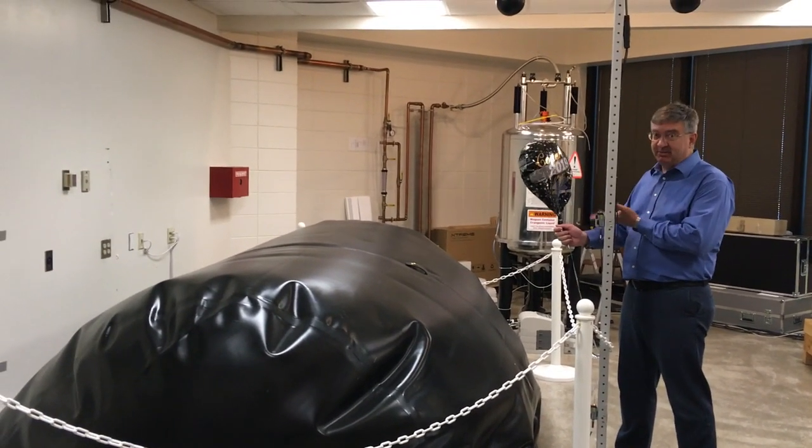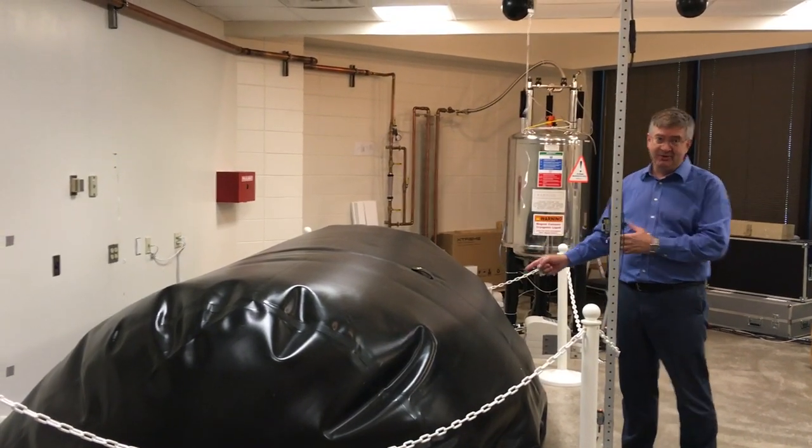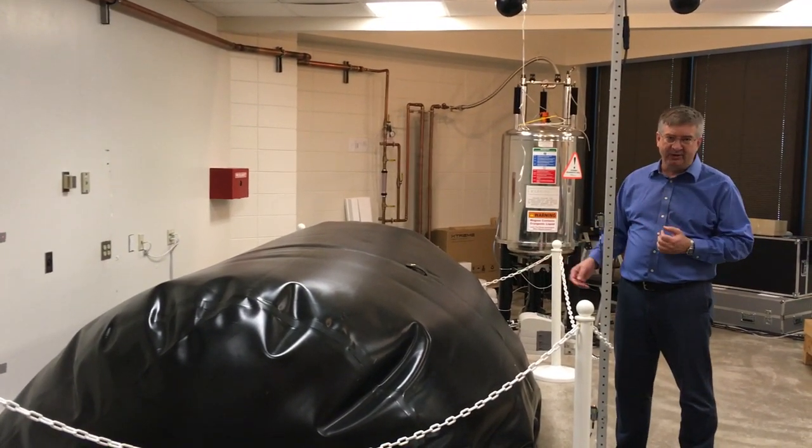This is a balloon full of helium, and this is also a balloon full of helium. It's just not floating because it's much bigger.